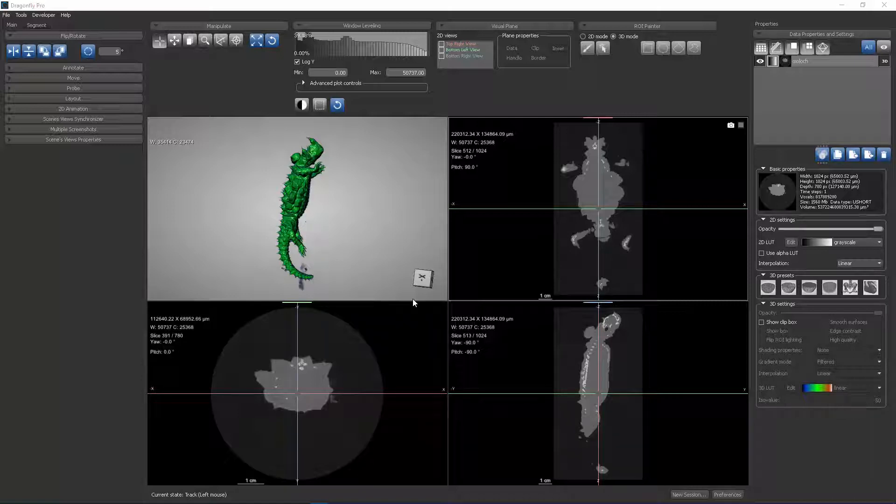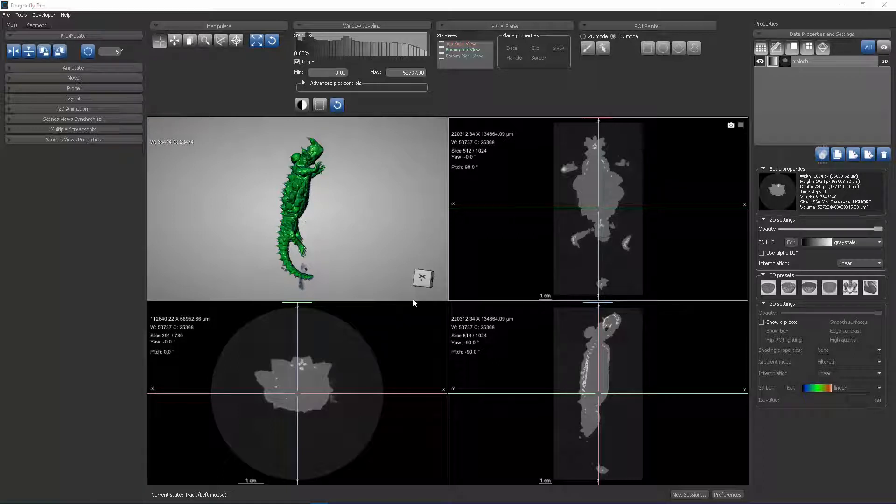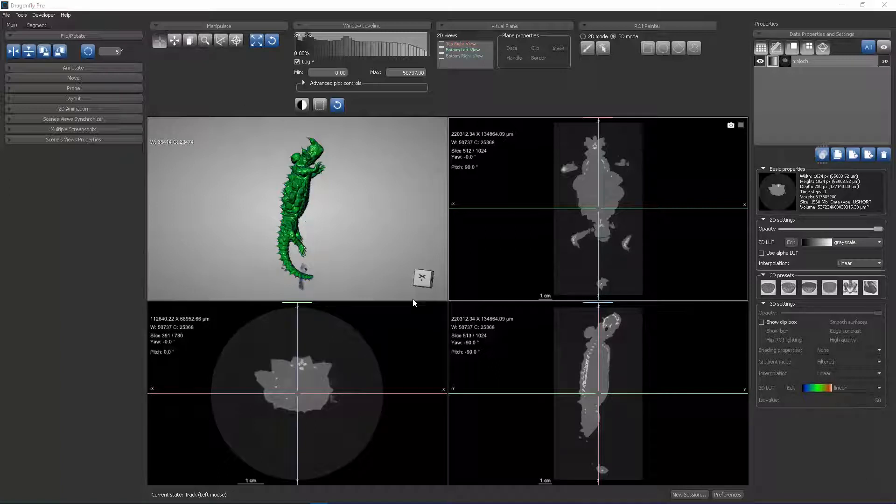For this demonstration, we have a data set that is a micro CT scan of a Moloch or a Thorny Devil. This data set was collected at the UTCT image scanning facility located at the University of Texas in Austin.